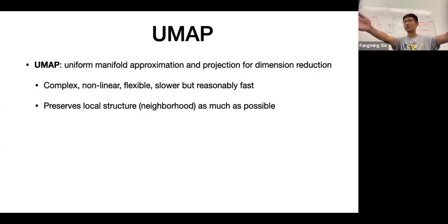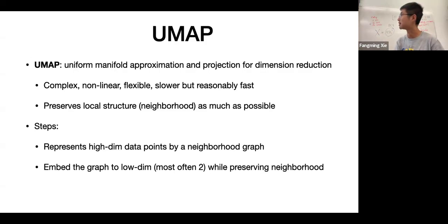But my neighbor is with these two. After UMAP, I will no longer be opposite with him, but my neighbor will still try to be preserved. Maybe I will still be close to the microphone, but there's no way I'm still opposite to someone. This global notion of distance and direction is no longer preserved. That's a necessary step. Okay.